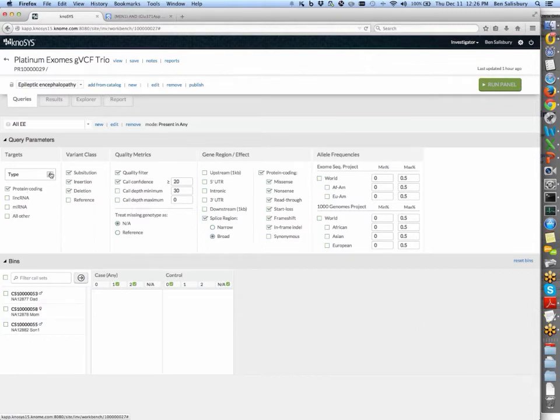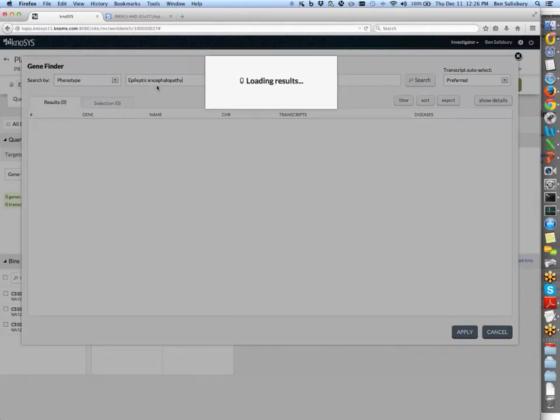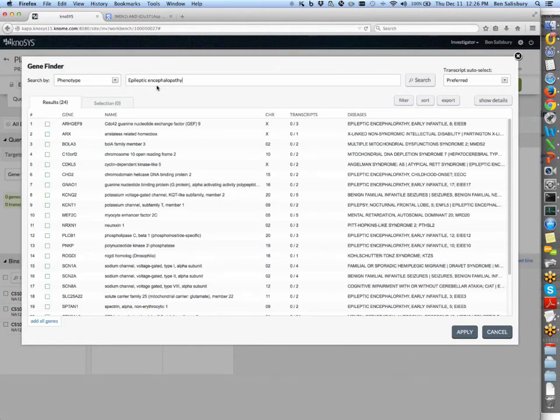Right now, it's starting off by focusing on the entire exome again by default. But let's choose to look for particular genes and transcripts. Here, we could be putting in gene names directly if you already had a list, or we could also search by phenotype. So here I put in our trait name again, and when I search, it finds a reasonably short list of results, only 24 genes.